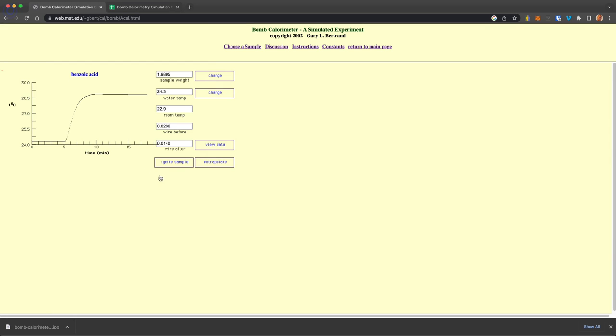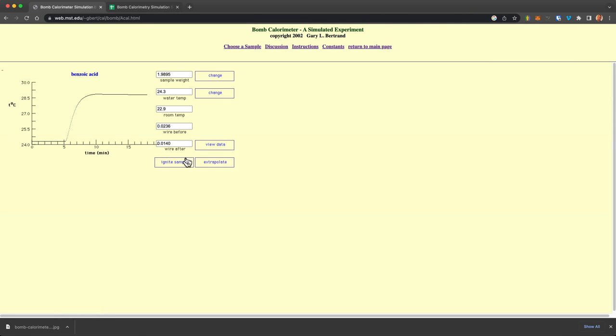So it gives you, beyond what you would do in an experiment, which is to collect the data I just showed, you can also do some of the analysis here.